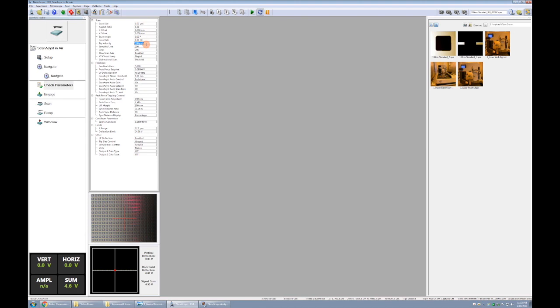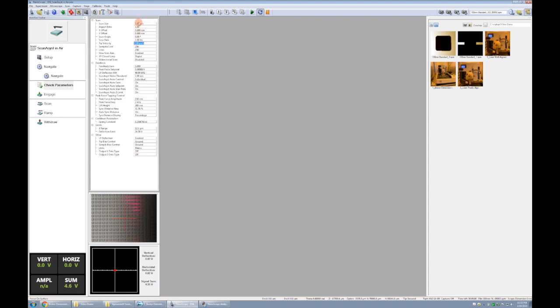The tip velocity is calculated from the scan rate and the scan size. I actually think this is the most important to keep track of rather than the scan rate, because it's controlling the physical velocity of your tip. That will really control how well you're able to scan up over and down features. As you change the scan size, the scan rate will stay the same by default. What I would do is if I'm changing the scan size, I would also change the scan rate to try to keep a constant tip velocity that I had determined is best for measuring the topography of my features.